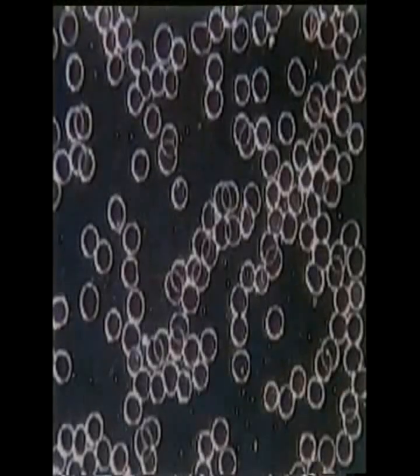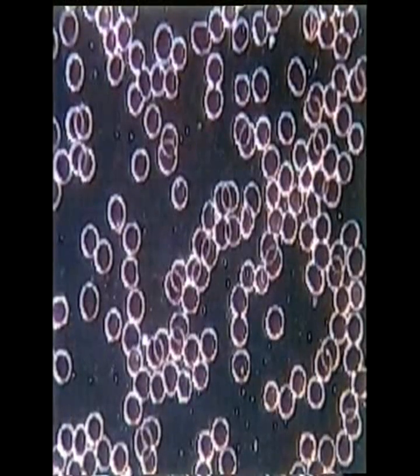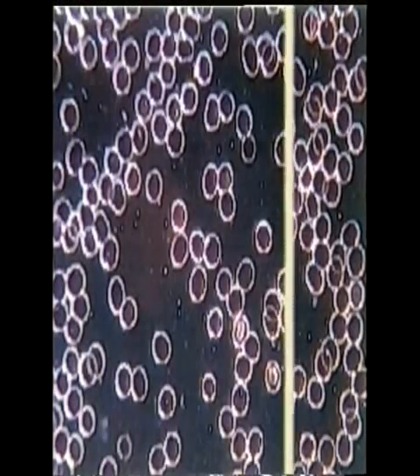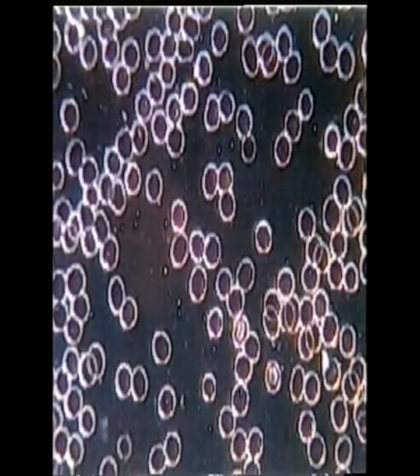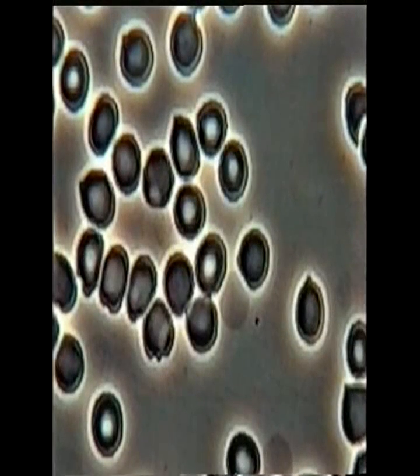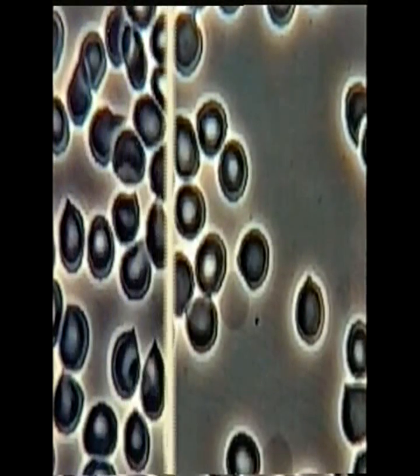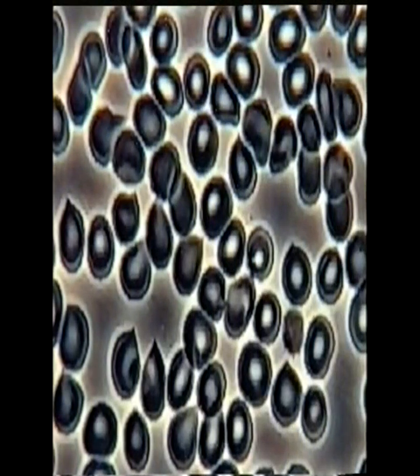First of all, we can see the blood of a woman who has used EM products in combination with a supportive dose of EMX for two years. In this picture, the erythrocytes are completely detached and the blood has an open structure. Transport of oxygen to the organ cells is free. Waste products from the organs are immediately removed. There is no blockage and the blood flows freely. There is no need for the heart to produce at high pressure to reach all parts of the body.